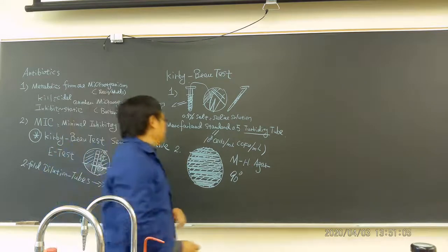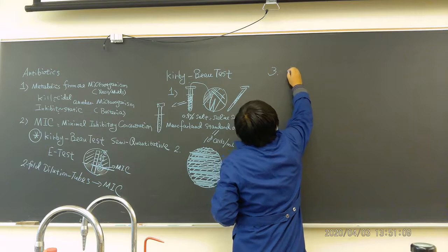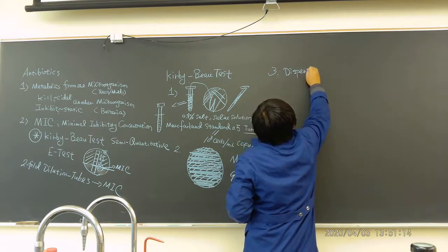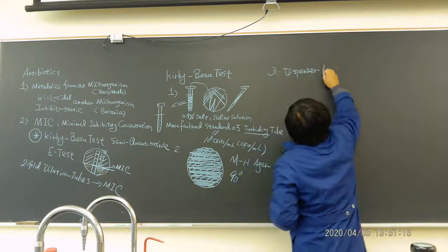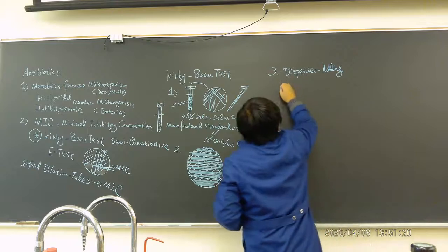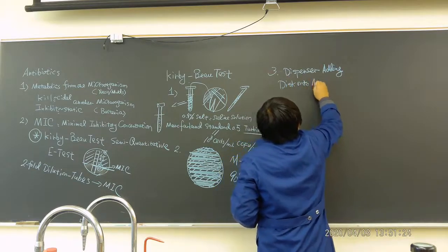Now what we have to do is use a dispenser, adding disks onto the agar surface.